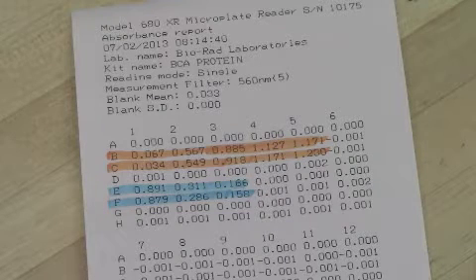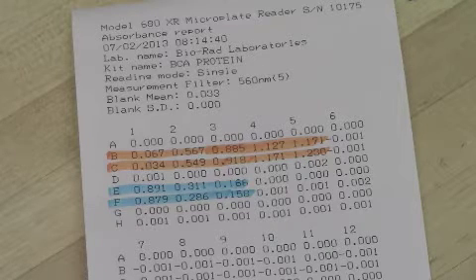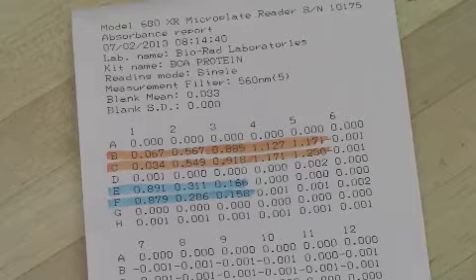Wait for the machine to print your absorbance readings. Here's what your absorbance printout should look like. The absorbances of the BSA standard are shown in orange and those of the unknown concentration in blue.